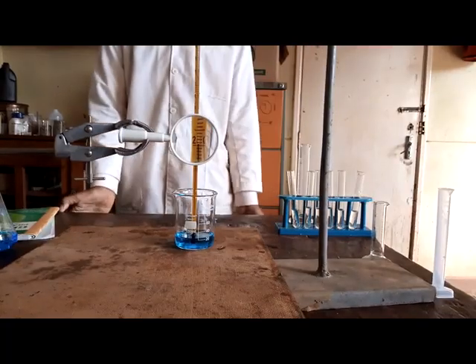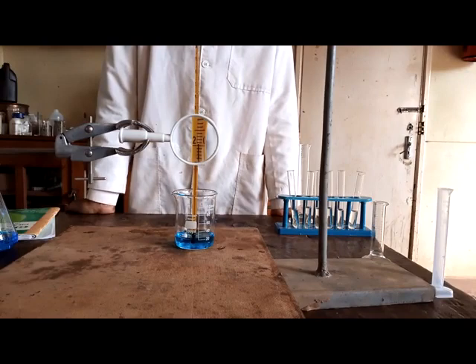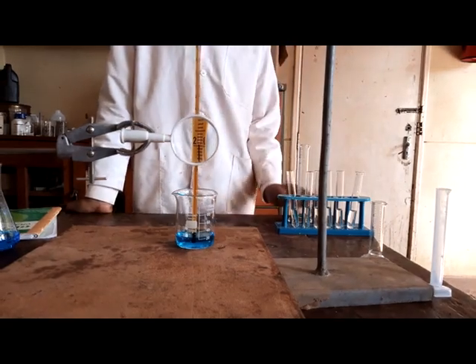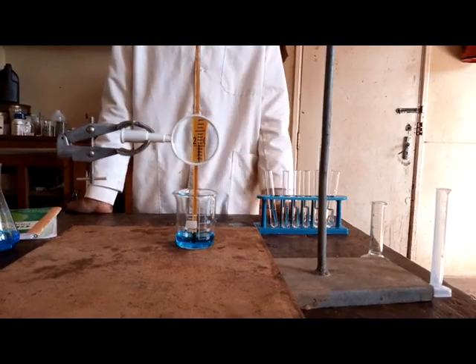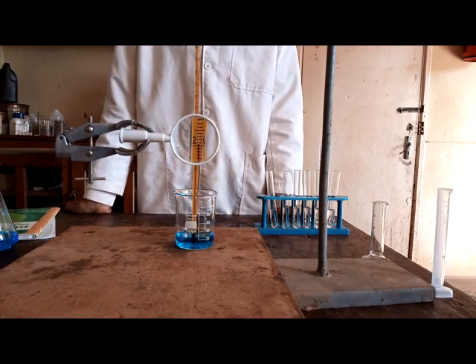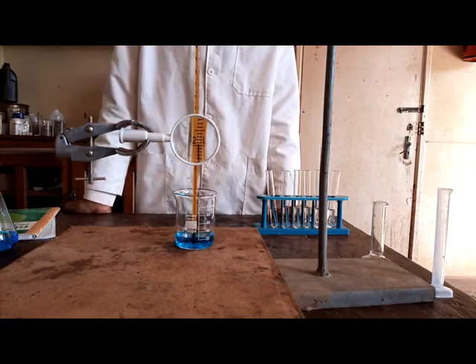In this experiment, the enthalpy of precipitation of copper hydroxide will be determined. So I have 20 cubic centimeters of copper 2 sulfate, to which I'll be adding sodium hydroxide in 5 cubic centimeter portions. What the student will be expected to do is to take the reading after every portion has been added.